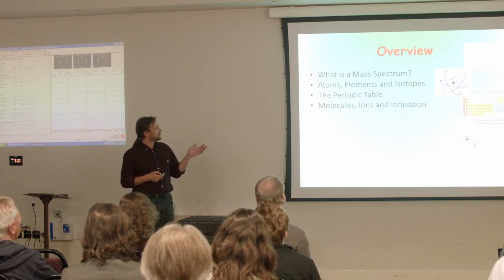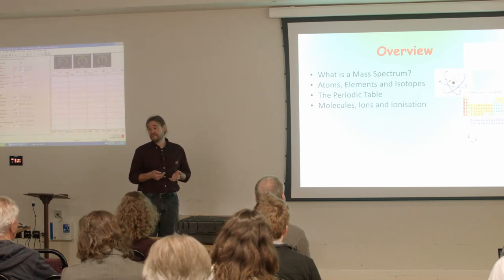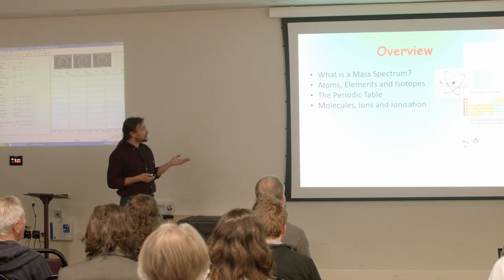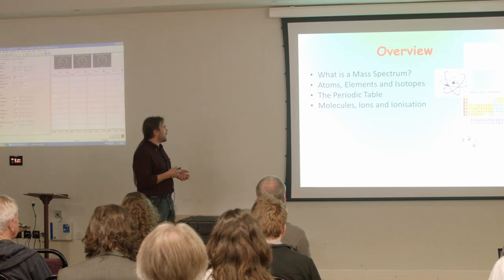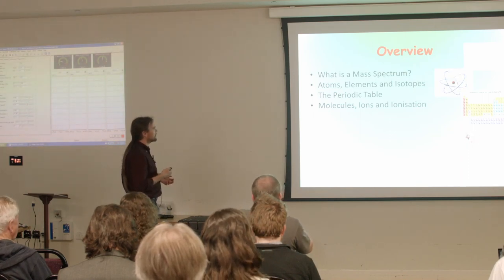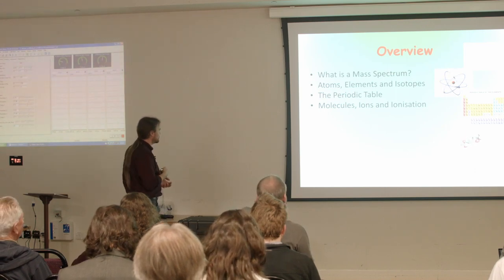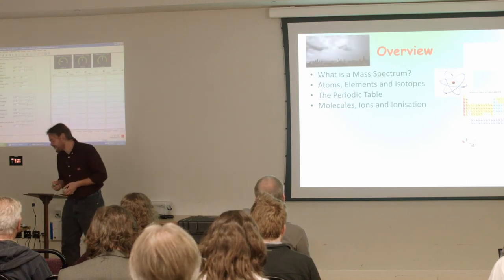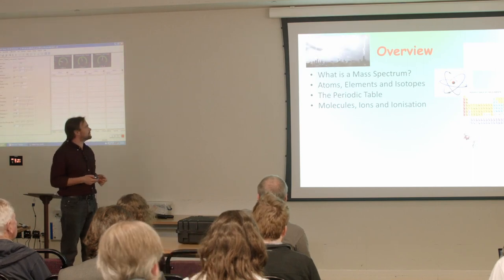And I'm going to describe what the periodic table is. This is a very important table we have. Then what molecules are, what ionization is. Hang on a minute, I'm just waiting for this to advance. All right, here's some ionization. So ionization usually involves high voltage of some description.